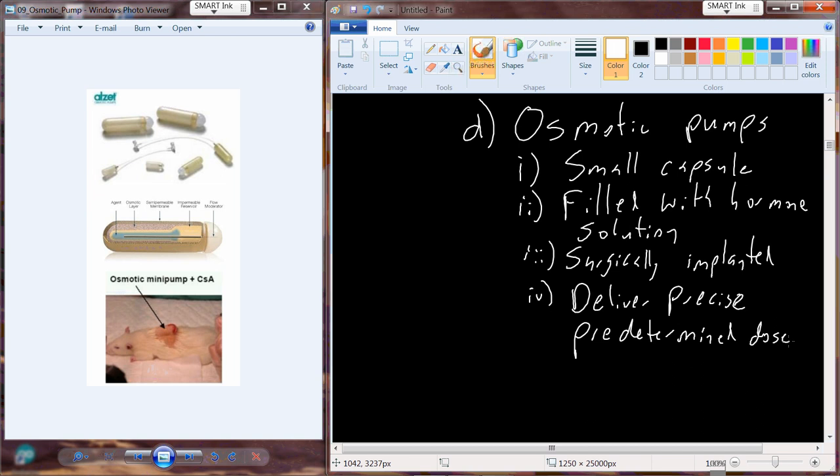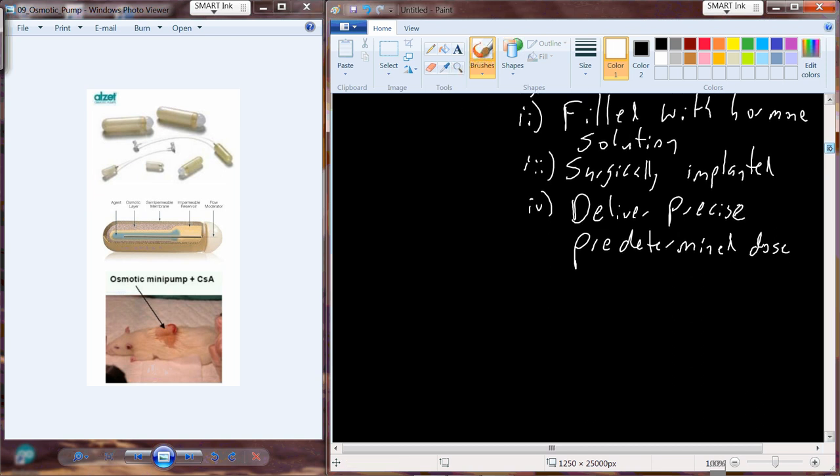Now, to be perfectly honest, with the silastic implants, with experience, you actually can get pretty good at setting up mixtures where you dial in a pretty good estimated dose. And so even though you're not ever as exact with a silastic implant as you can be with an osmotic pump, we can get really close to having a pretty consistent delivery that's not really super physiological or subphysiological, pretty close to that physiological range. So I use silastic implants mostly. We've looked at osmotic pumps for future studies.